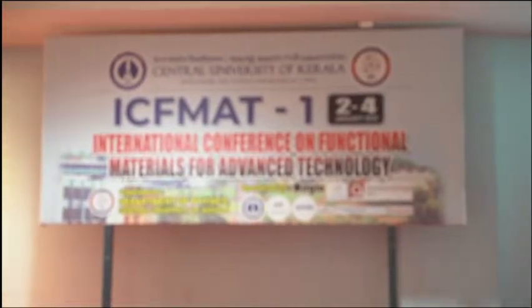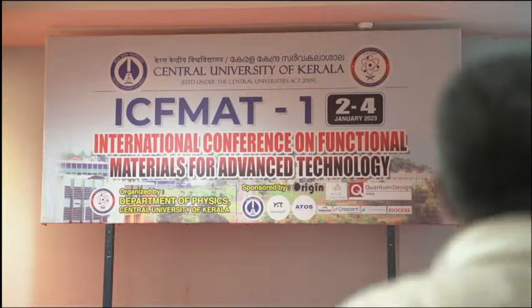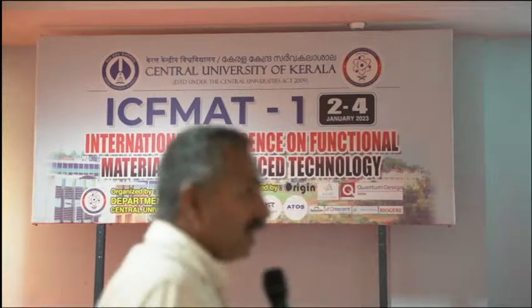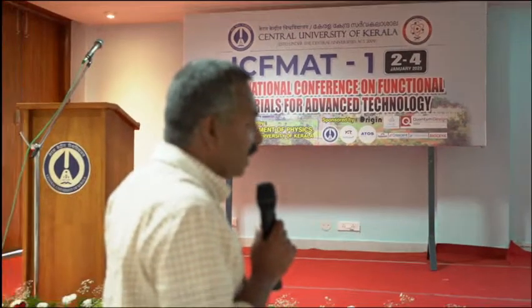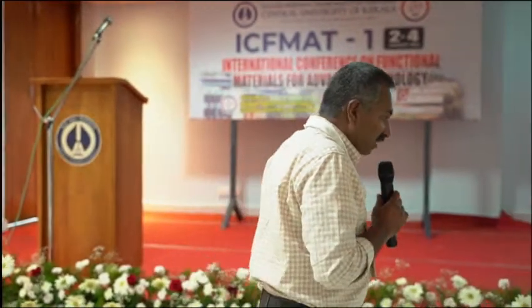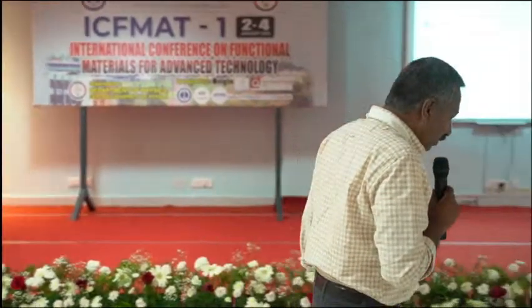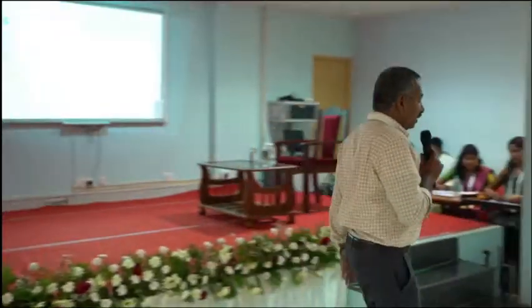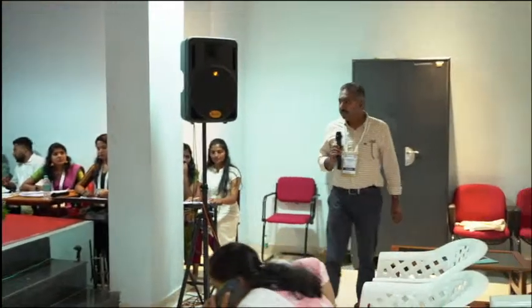I have one question, Dr. Igor. Because the spatial sensitivity is so high, in the nanometer domain, your sample should be very flat, isn't it? Should the surface flatness of the sample be very good to do this measurement in PFM? Yes, this is a very good question.